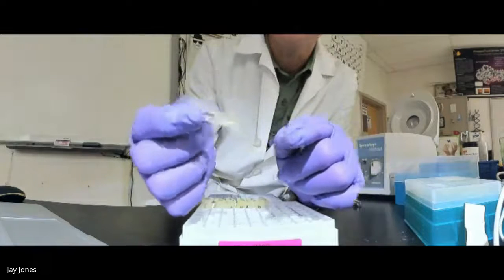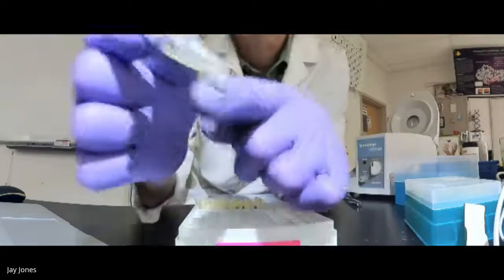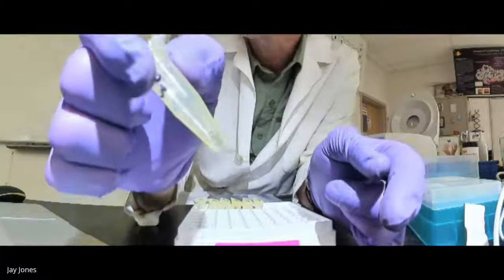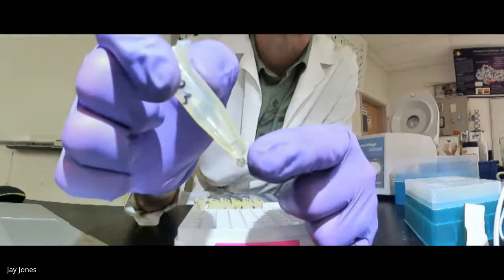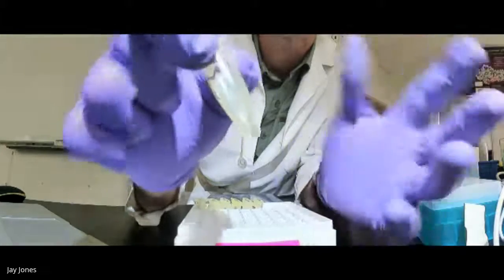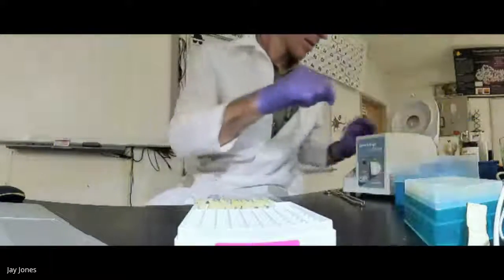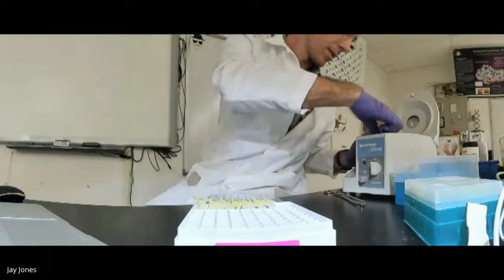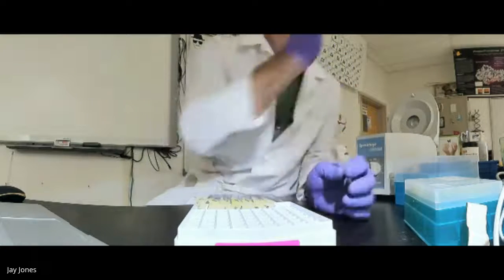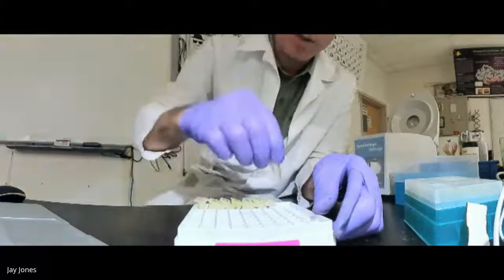This is tube seven, which I think is T2. And look, you can see the liquid in there. Hopefully you can see that. That liquid is 60 microliters of pure plasmid DNA. 60 mics of pure plasmid DNA, and that's a mini prep. Column's done. Nice. T2 looks good.